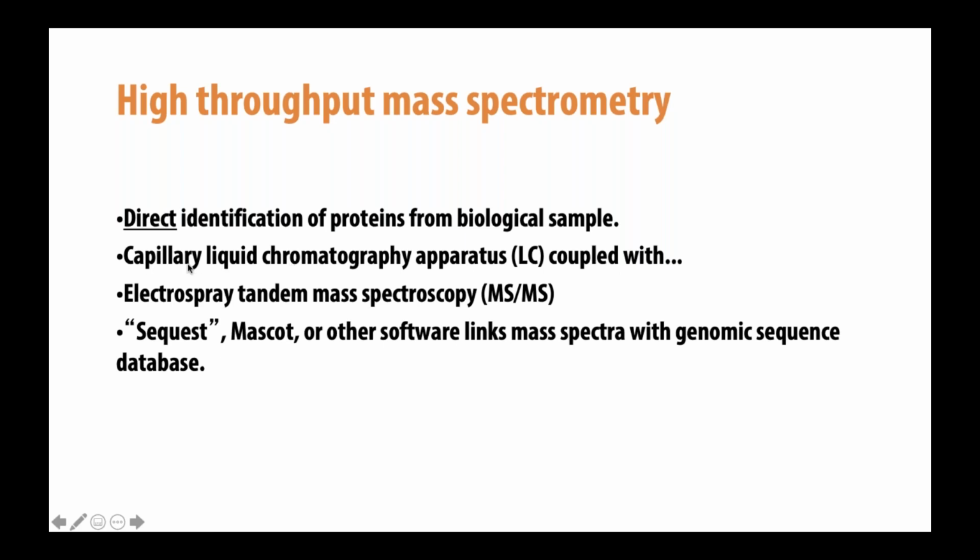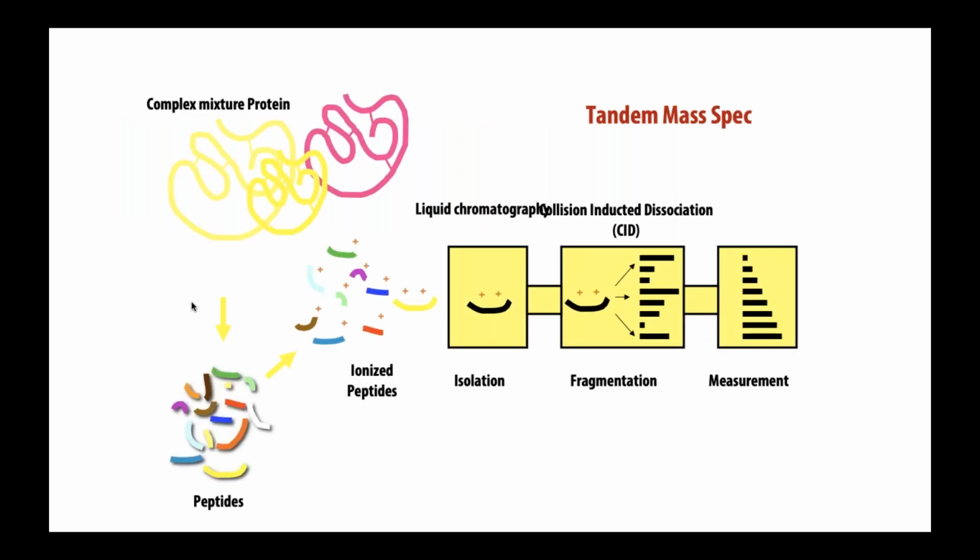You typically do some kind of chromatography on your peptides, and then in order to identify these peptides, you have to somehow detect them and detect their size, basically, their mass. And so to do this, you have to charge these molecules in a way. So you ionize them, and then you have to have some kind of detector to detect these peptides.